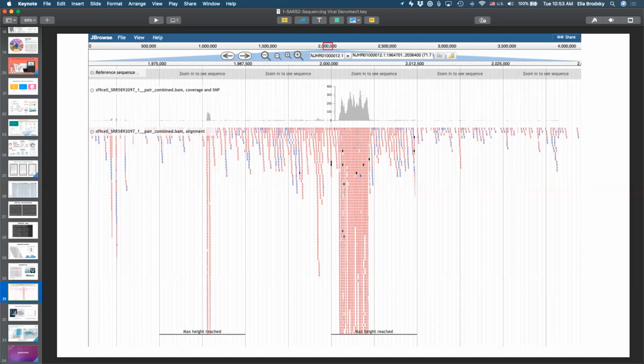De novo sequencing of viruses, of course, is one of the primary objectives of next generation sequencing, to understand not only the presence of a specific known virus, but also the presence of novel viruses. So there are different ways of doing that.